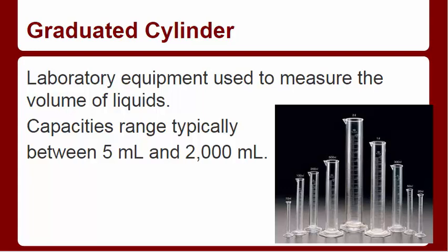And you can have small and big ones, ranging from little tiny ones, 5 milliliters, up to something big like 2,000 milliliters. I think you can have larger ones, but here in our lab, the largest one we have is 2,000 milliliters. That's right? Correct, yeah. Okay.